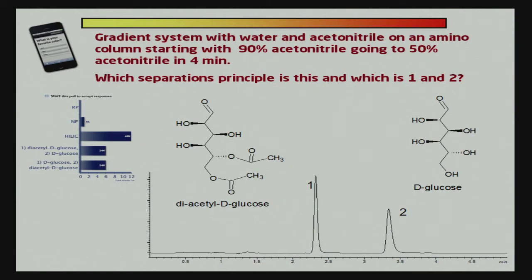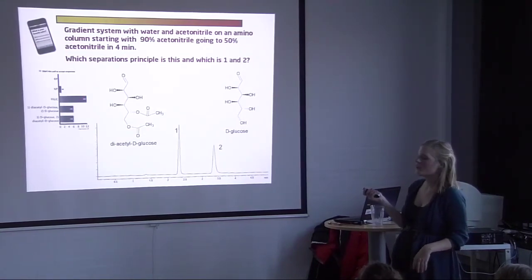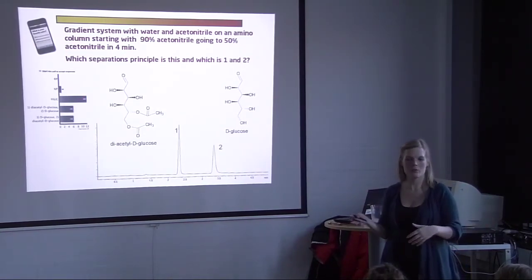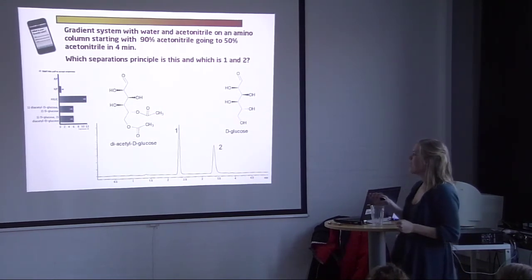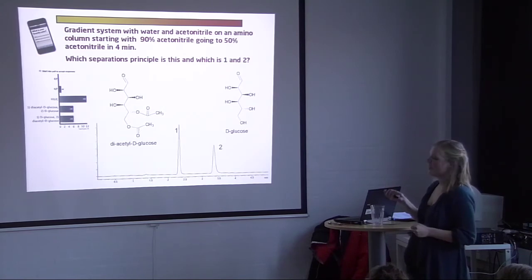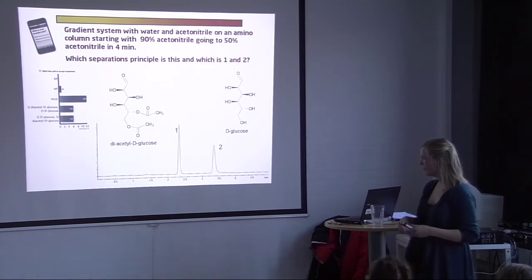So you all guessed more or less that this was HILIC. None of you voted for reverse phase, which is great. You realized that you started with a high organic content, which means that it's either normal phase or HILIC, but you got water, which means that it's HILIC. And the order of these two, that is more difficult. So that's 50-50 on the votes.